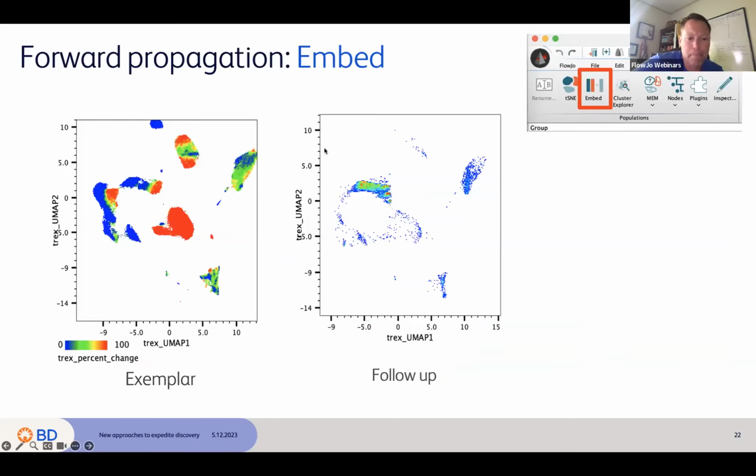Okay. So just an example here of the previous data where we took in some ACLL, some CLL files. We took an exemplar where the differences are showing up between the two, CLL versus ACLL, red versus blue. You get a new file. We map that new file's data to produce UMAP scores on the same T-REX UMAP score and go, okay, if there's a lot of cells right here, and then a few cells in the combined not so different populations, maybe this is one of my ACLL files. And you've got a way to compare it and start making judgments like that.